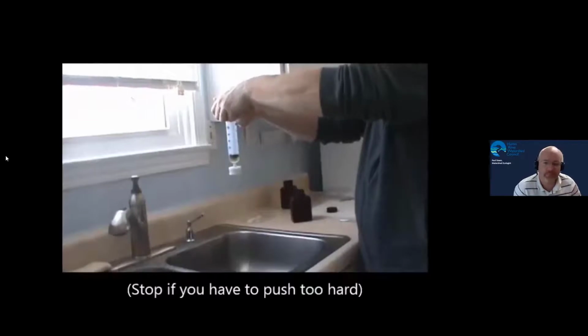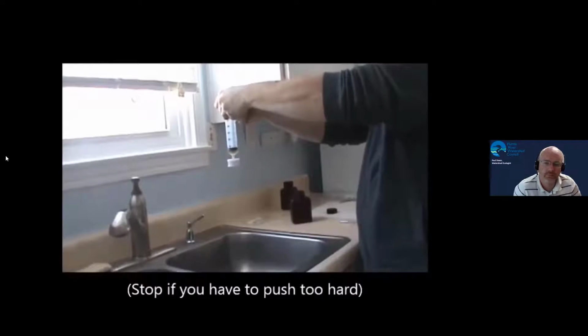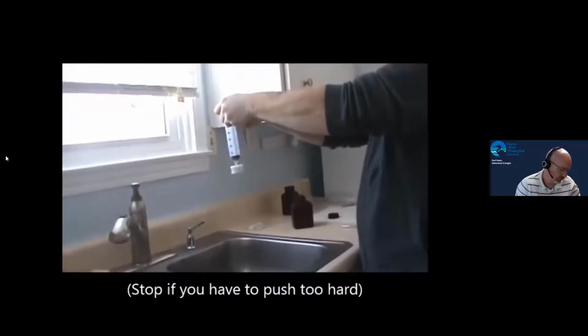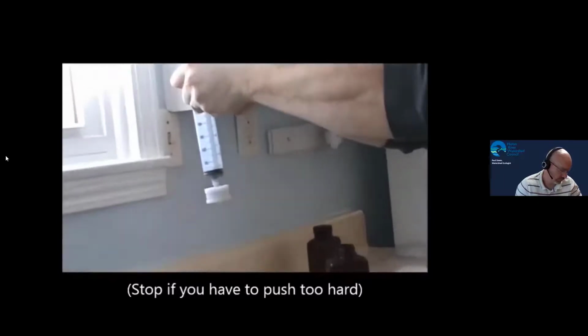If your sample has a lot of algae or other particles in it, it may become too difficult to push the full 50 milliliters of sample through the filter. In these situations, stop pushing and note how much water you were able to filter by reading the side of the syringe. There is a place on the datasheet for you to record this information.